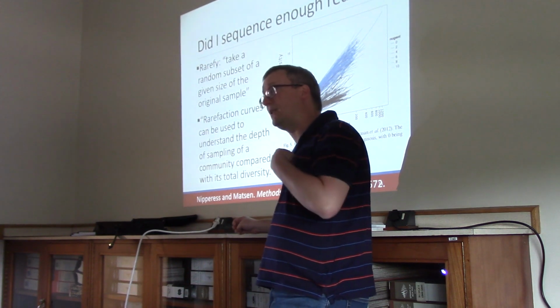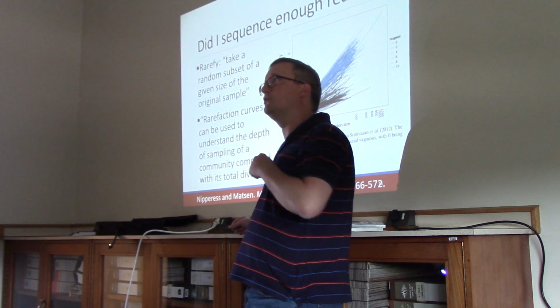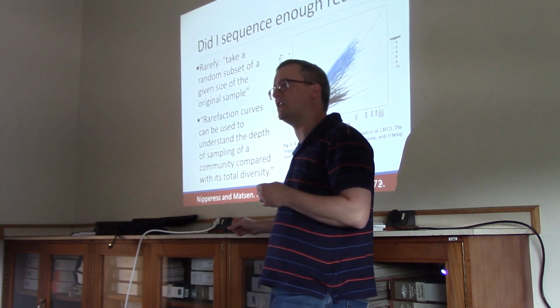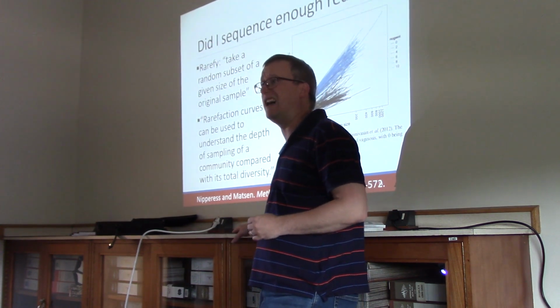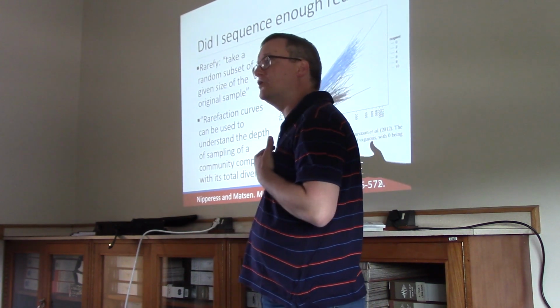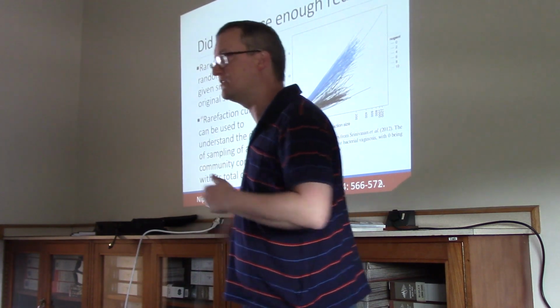So one might apply rarefaction analysis in that context to say, if I chose 50% of these spectra randomly and went through the identification process, would my protein counts change dramatically? And generally speaking, yeah, they drop quite a lot. So this rarefaction analysis is one of the ways that we use to evaluate how completely we've done this sampling.